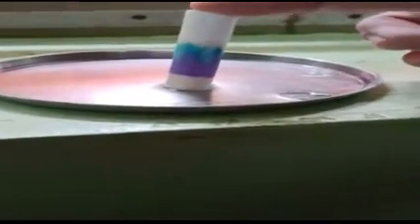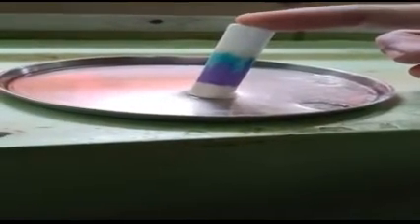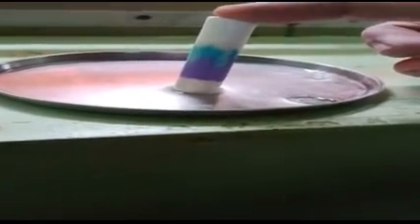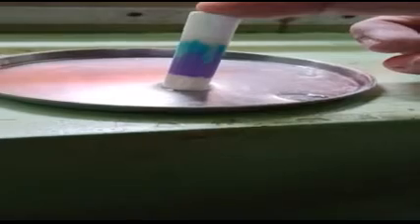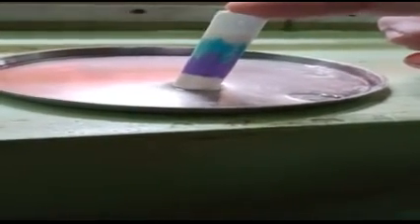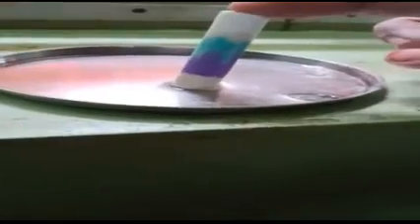Before the water reaches the top, we must take the piece of chalk out of the water. See, I kept the blue ink. Three colors are mixed in it: purple, blue and green. Here the chalk piece is the medium.